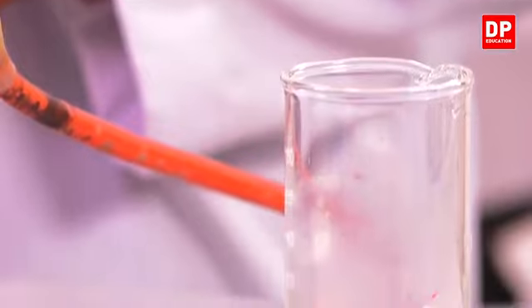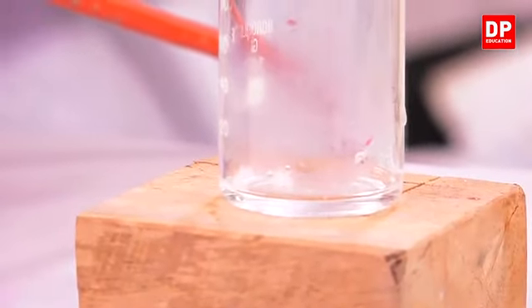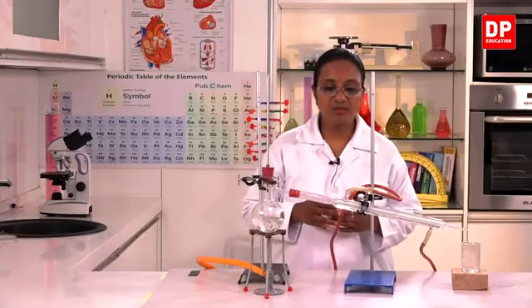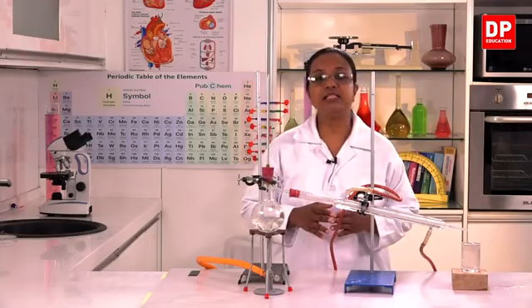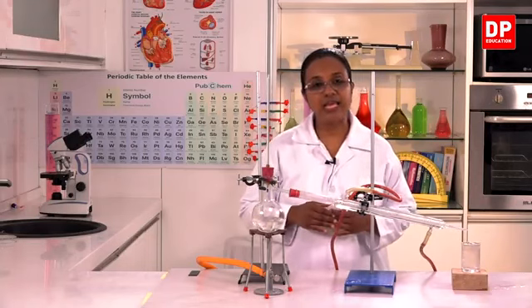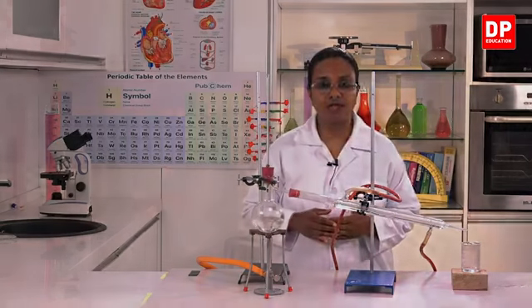So that will be the distilled water that is coming and getting collected in this beaker. So here you can observe the simple distillation apparatus that we use to obtain distilled water from well water.